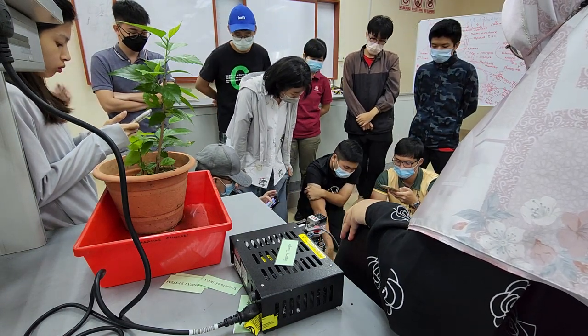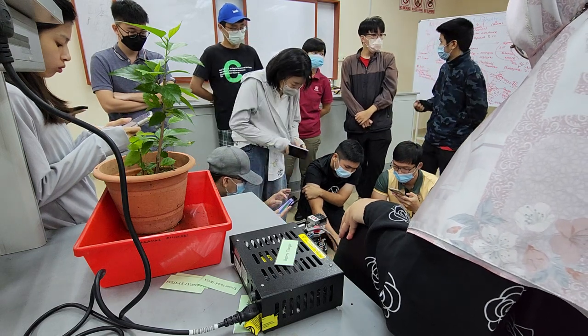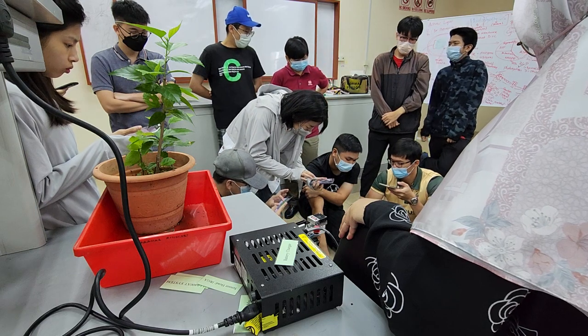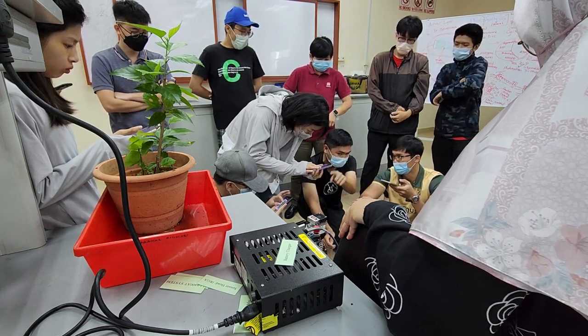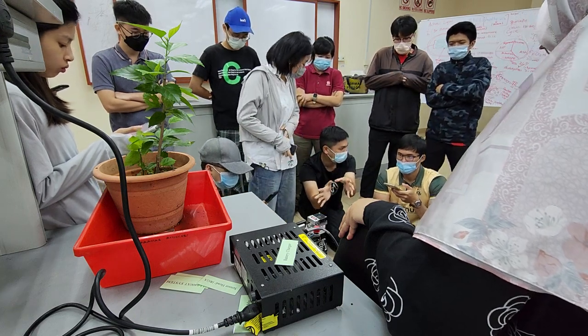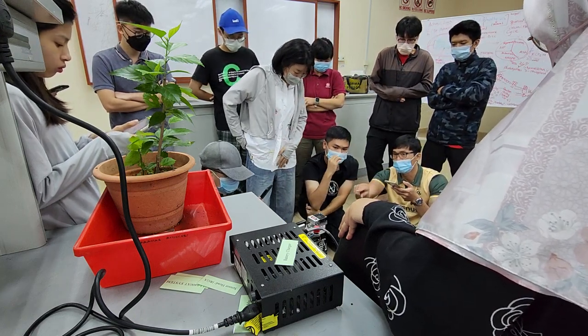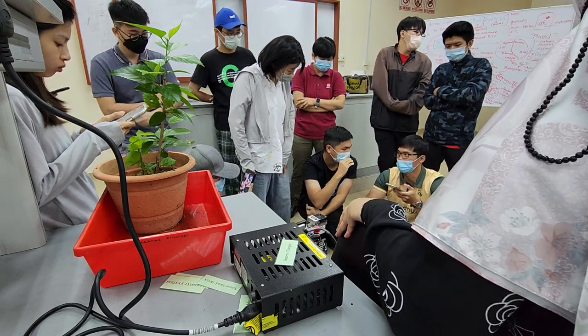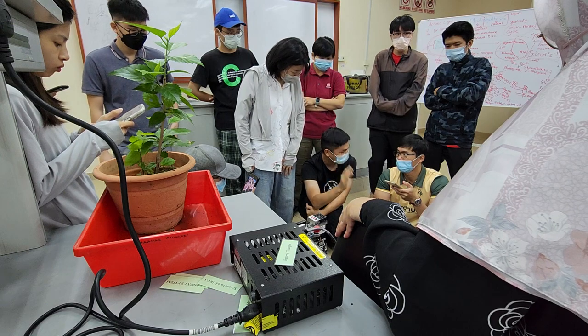Because we are in the aircon room. Still increasing. Just now when we open it, it decreases. Yeah, because it senses the outer. Basically, when you clip it, it will be isolated. It is sensitive, so it has to use battery. No, it won't hurt the leaf. No, it is not destructive data.